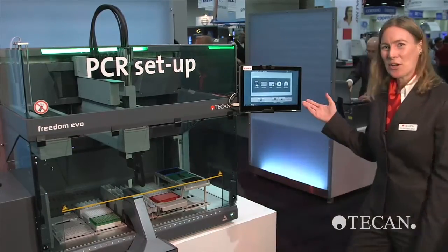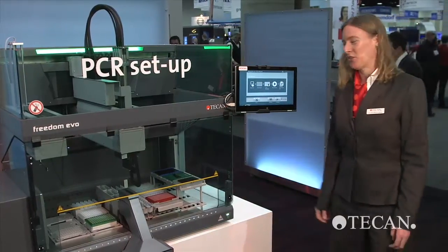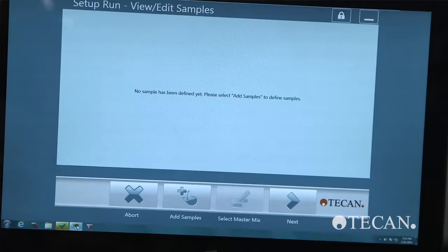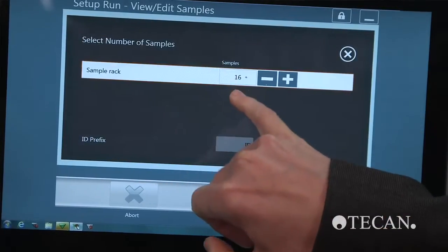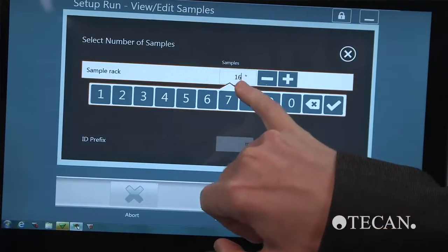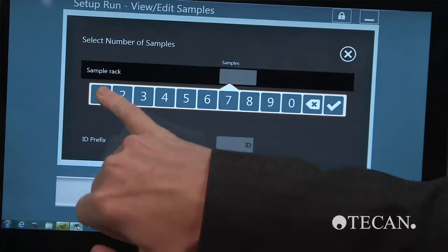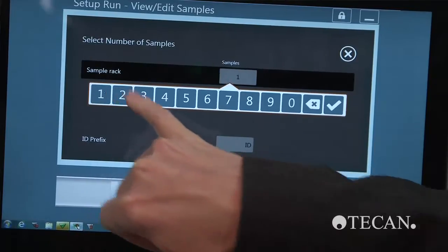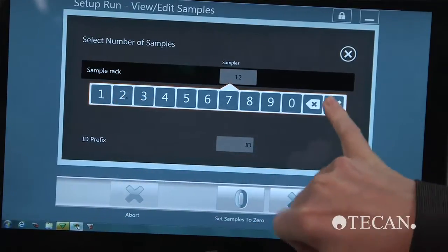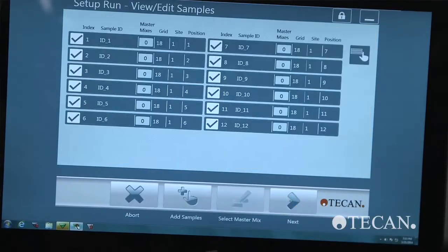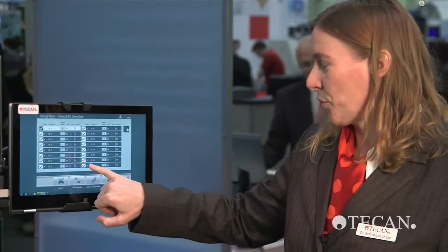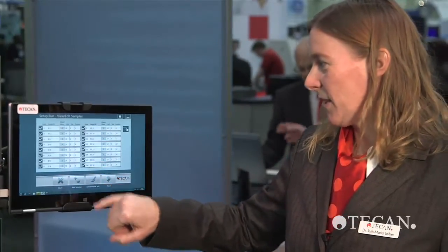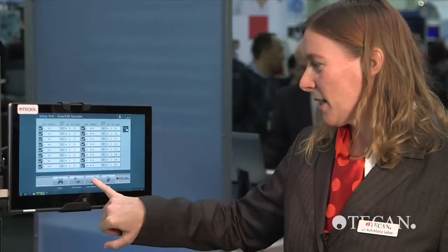Now let me show the software to you. You can enter your sample information directly. You could also enter the sample number by scanning or from file. And once you have your samples, you can associate them to your desired master mixes.